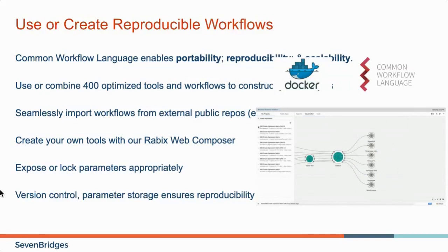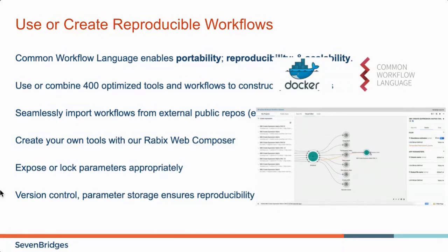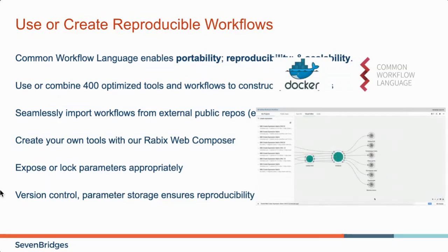and all the other parameters. And when you're finished, everything will be neatly wrapped in common workflow language and available to run on the platform. So we make it really, really easy to bring in your own tools. And it's also very flexible as well.